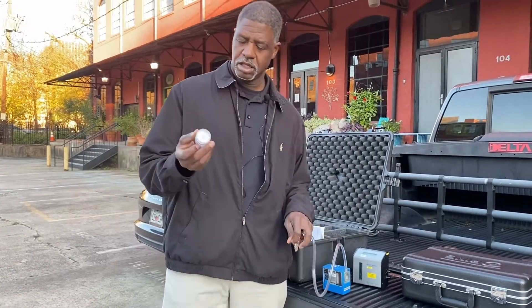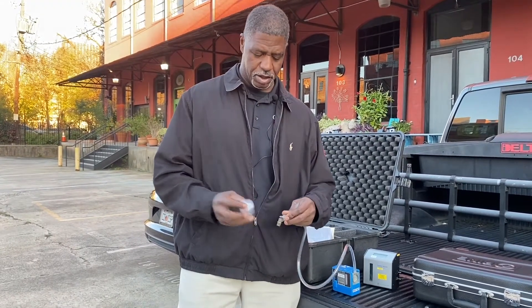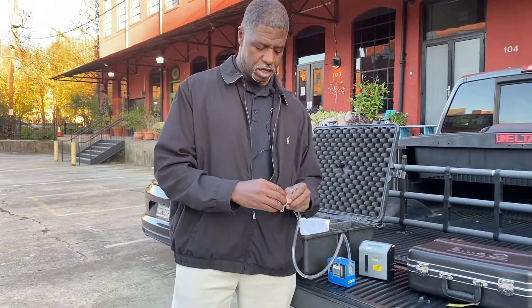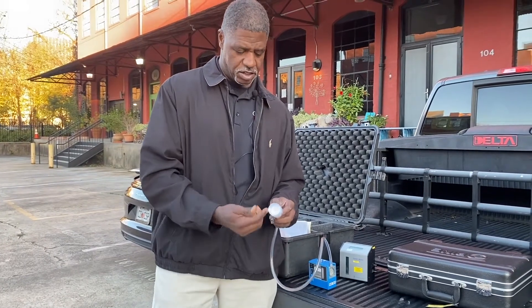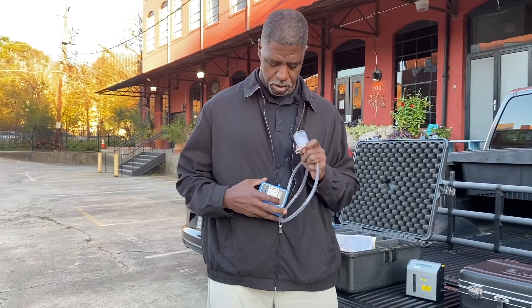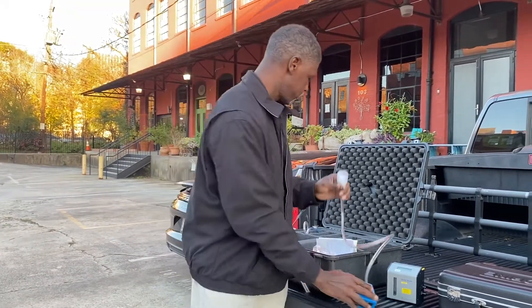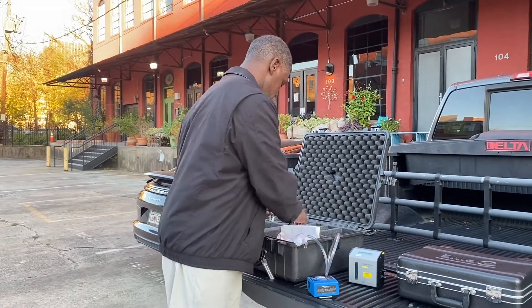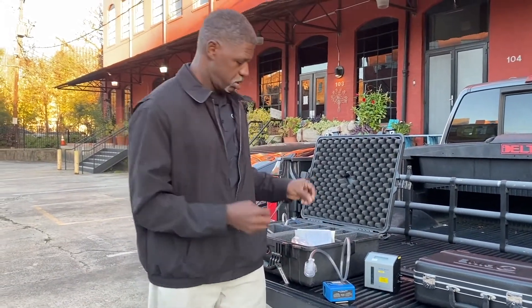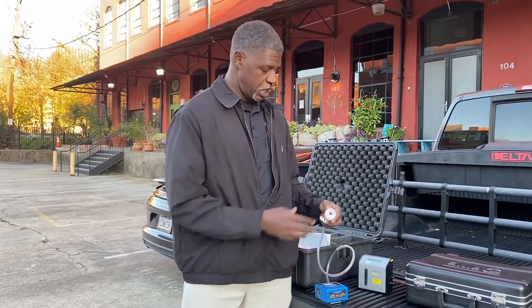This is the back of the actual cassette. You don't want to put it on backwards — you want to put it on forward so that the cassette itself is facing correctly and the air is being pulled by the pump through the inlet. We already took off the covers and the plugs. You keep these on until you're ready to do the sampling so that nothing gets in there that would cross-contaminate your sample.